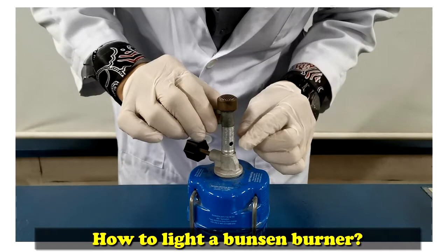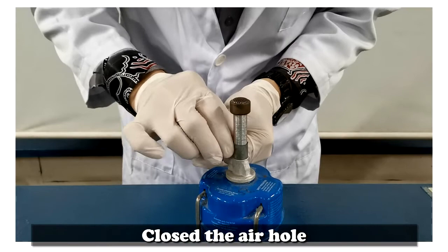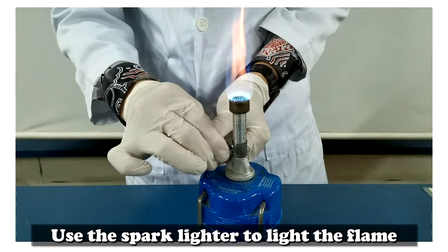How to light a Bunsen burner? Close the air hole. Use the spark lighter to light the flame. Adjust till you see a blue flame.